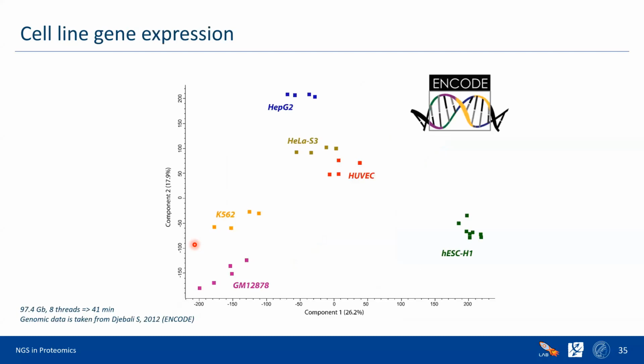Cool, but overall, you can analyze cell lines and you can do it very quickly. For example, I analyzed this many replicates of different cell lines from the ENCODE project in 40 minutes on my computer. So it's pretty reasonable and pretty quick.